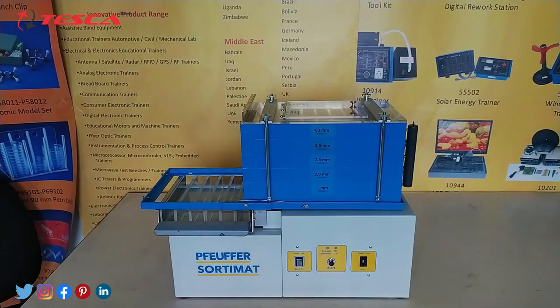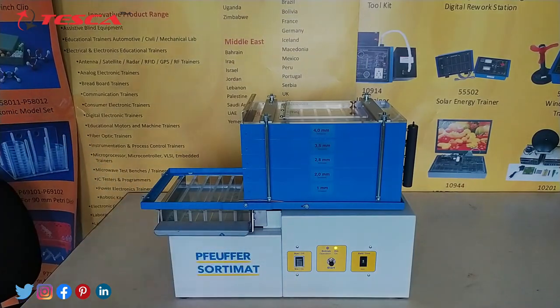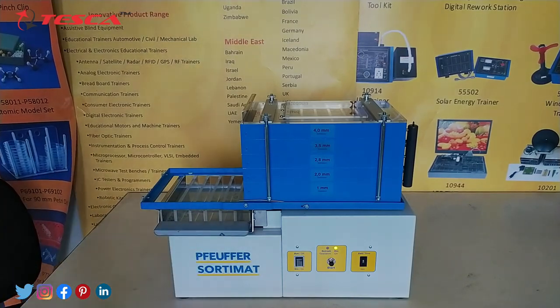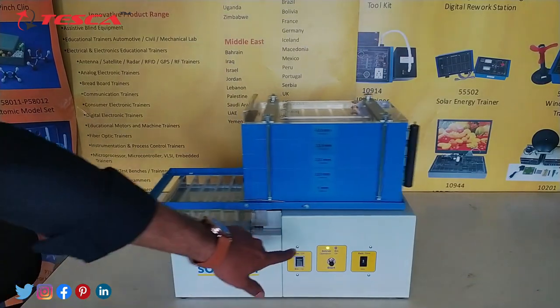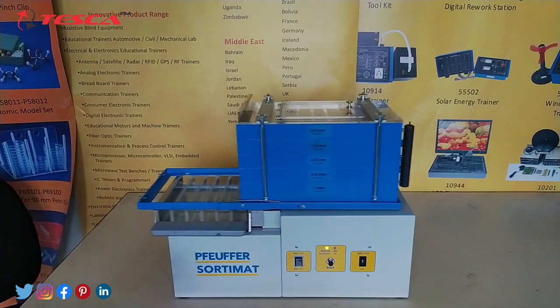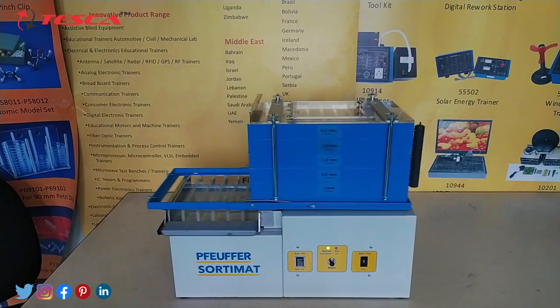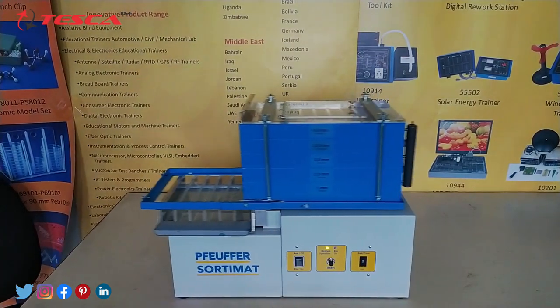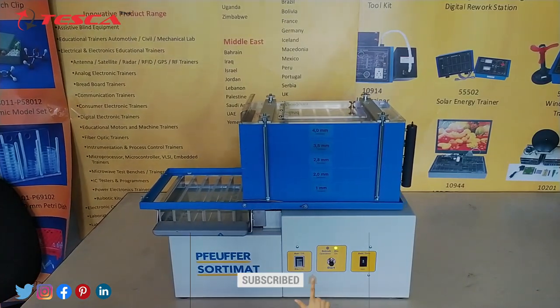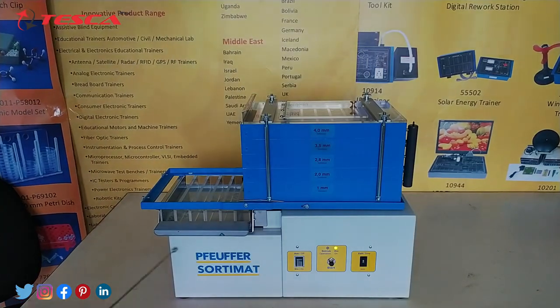Now let's talk about the working of this kit. First of all we will switch on the main supply. The indication LED shows that the power supply is on. Now we will press the start button, and the LED indicates that it is in operation mode. The time is set to around 1 minute, so this kit works for 1 minute. Until the completion of 1 minute, don't stop the kit. After 1 minute the apparatus stops automatically.